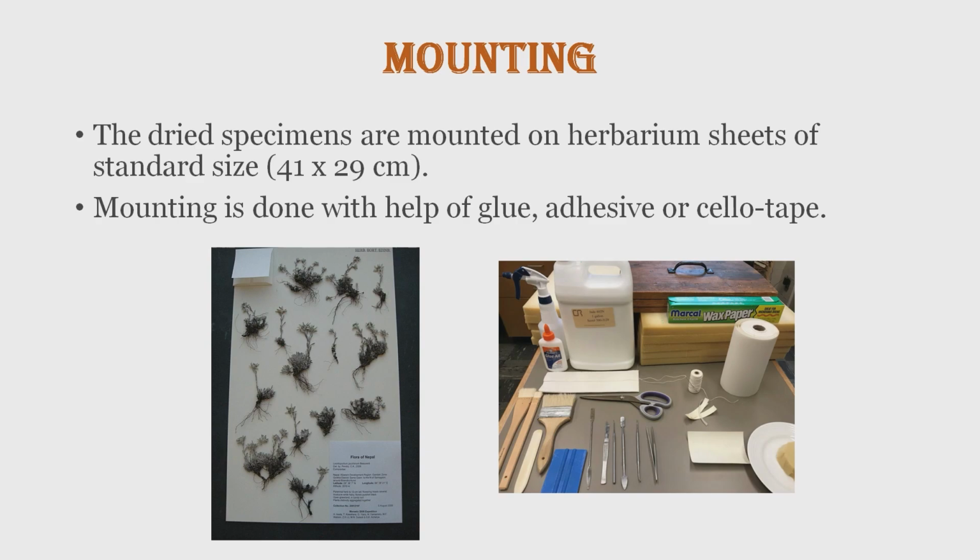Next, this pressing and drying process can take place for 15 days. In some cases, depending on the season, it can also last even for 1 month. Once you see that all your specimens are dry and no moisture content is there, then you can go for mounting.